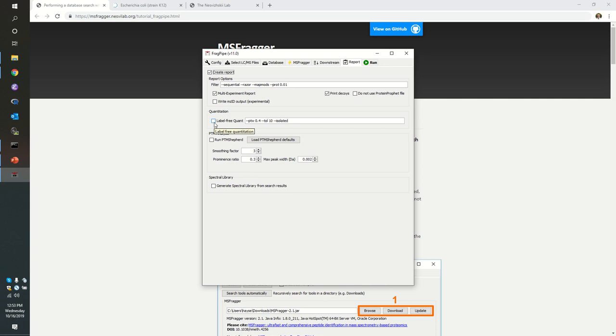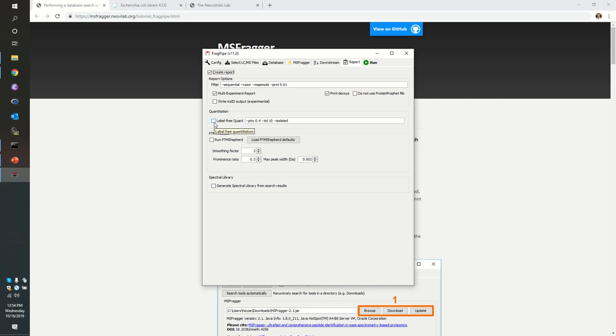That is a very legitimate way to find differences between cohorts, like our red versus yellow demo. But frequently, you'd like to get a bit more information out than just, is this protein differential and what direction? You might like to say, is this protein at a 30% higher concentration or a 30% lower concentration? If you get to that kind of precision, frequently people like to move away from spectral counts and instead use chromatogram integration.